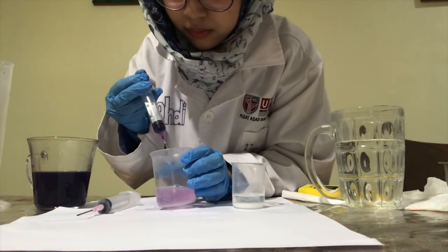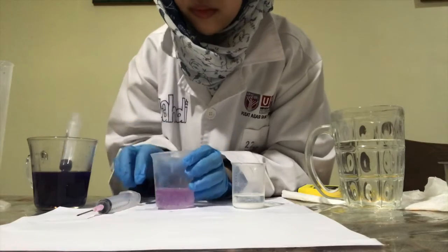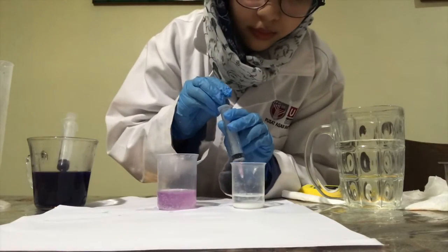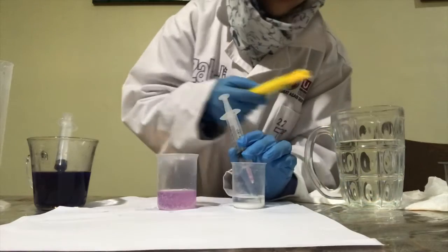From the adding of the pH indicator, it shows that the pink initial color of the analyte slowly turn into the purple color of the red cabbage.